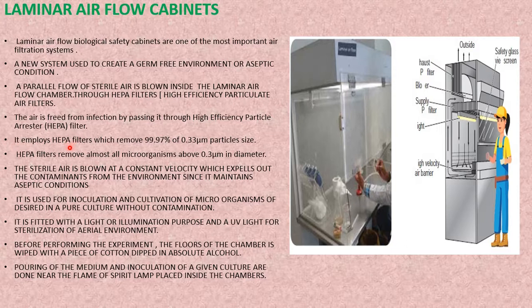It employs HEPA filters which remove, as I told you, a very high percentage of microorganisms, even particles of 0.3 micrometers in size. And sterile air is blown at a constant velocity. As I told you, it is supplied with a continuous flow of air, which expels the contaminants from the environment.